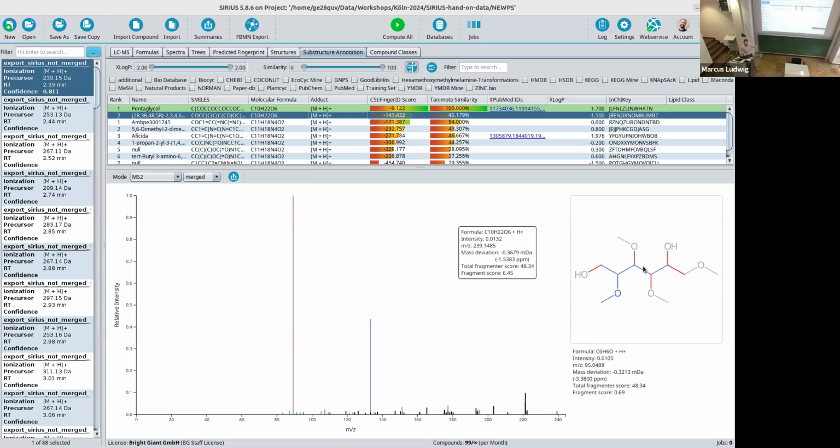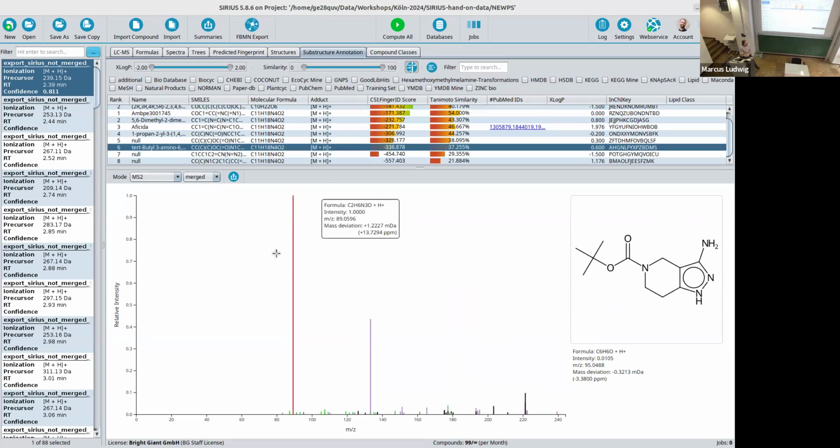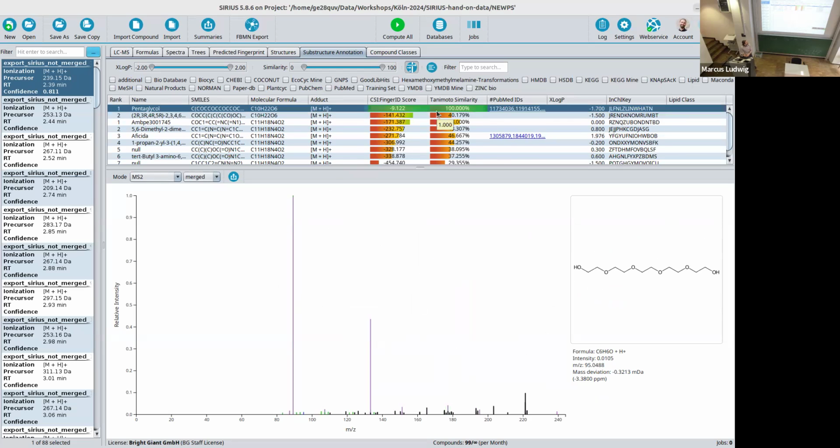If we can cut it into pieces and assign it to a peak, we can do that, but we don't consider rearrangements. So if the spectrum is basically all black or all green, it means we cannot assign peaks with substructures for this hit. If it's all purple, we annotated them. So this is mainly meant as a sanity check for that.